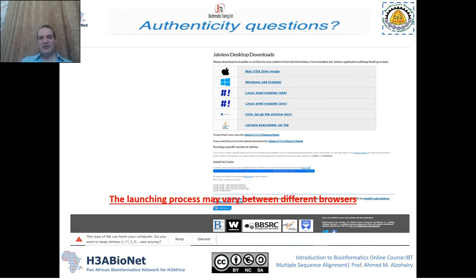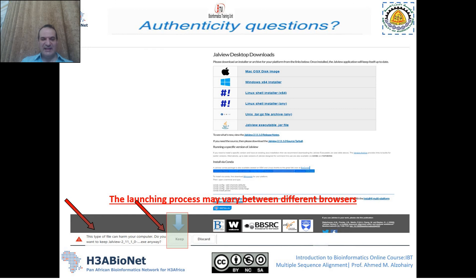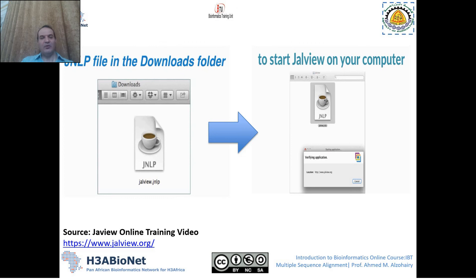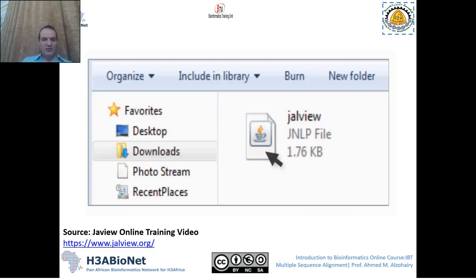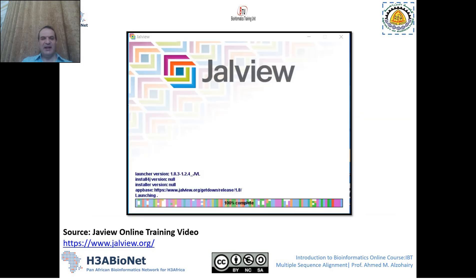You may get a warning that potentially harmful software could be downloaded to your computer. You can just press 'Keep' to allow the download to proceed. Once Jalview is downloaded to your downloads folder, you can double-click to open it on your own system.